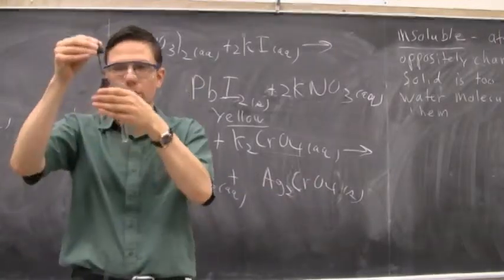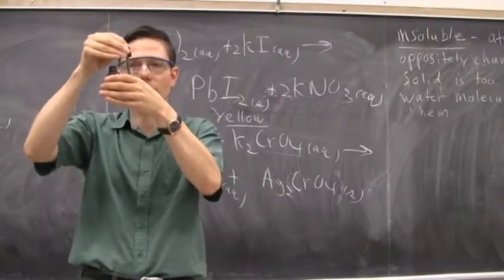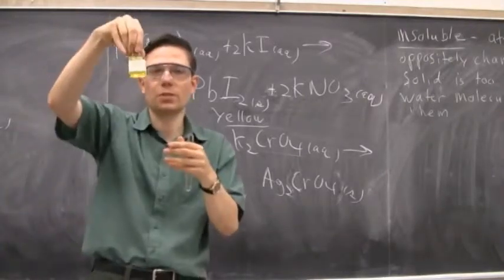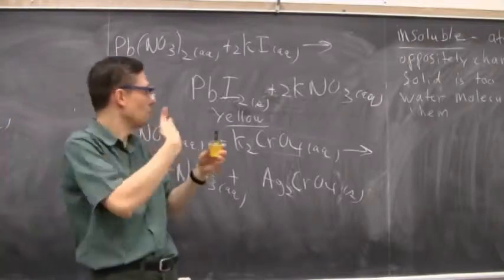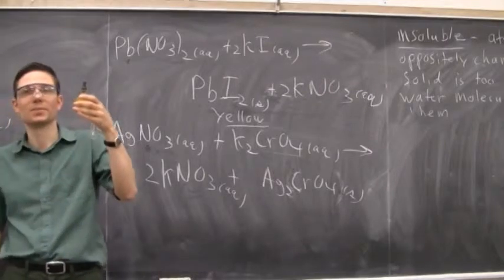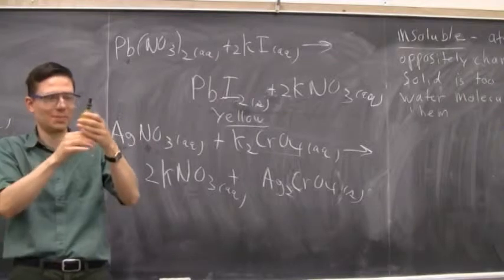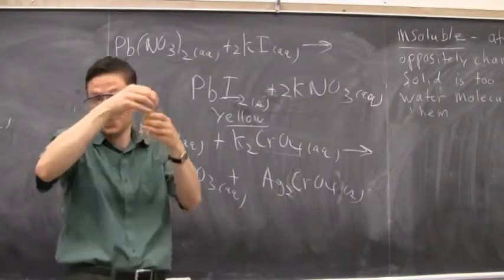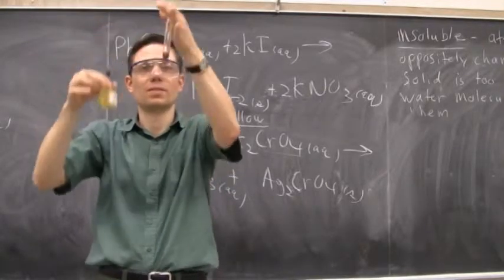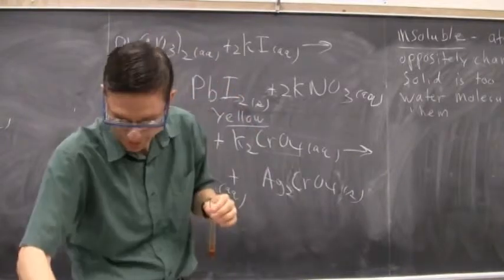All right. And the silver nitrate is actually a colorless solution. The dropper itself is a little bit black, but that's all right. It's nothing to worry about. And then I'll add the potassium chromate. But again, now this won't be yellow, and it won't be white. So what do we think now for color? Blue, pink, red, brown, purple with pink polka dots. Yeah, that would be interesting. There we go. We got this tomato juice looking color, so a reddish type color.